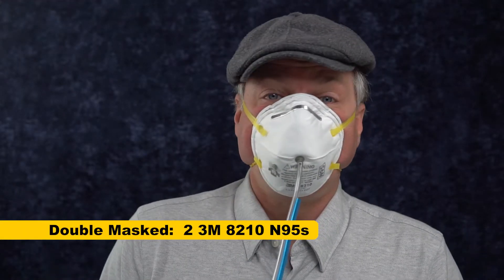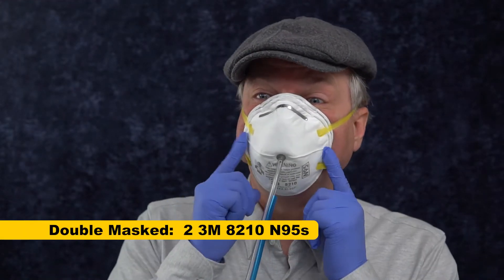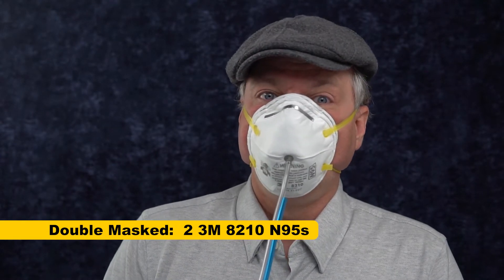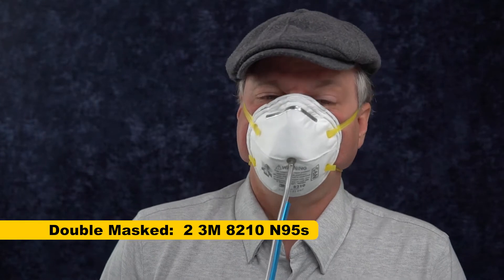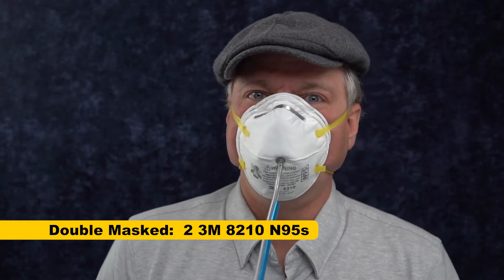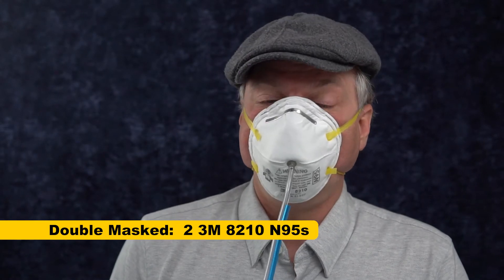I have no idea how I'm going to get this on. Well, as you can probably guess by looking, this is really tight on my face. So it should probably test well, but there's no way I could wear this for a work shift. This is not comfortable. I don't care if it tests well — I'm not doing it. But I do want to know how it tests.